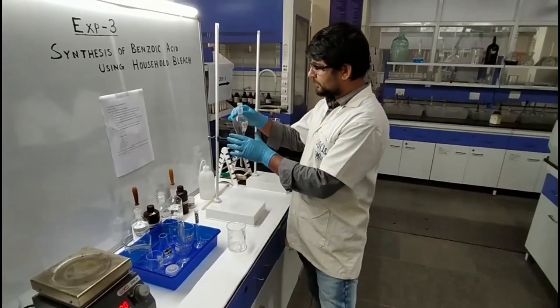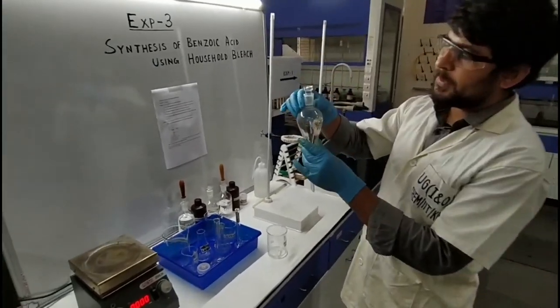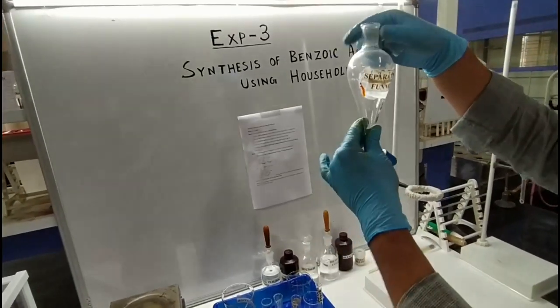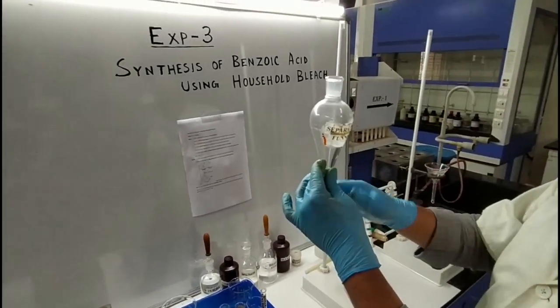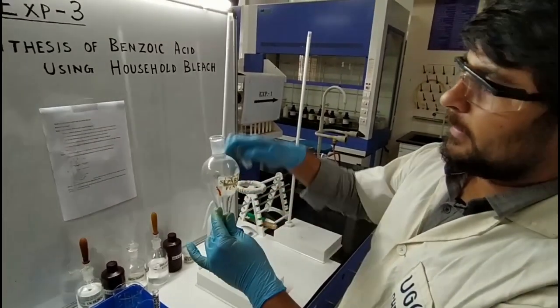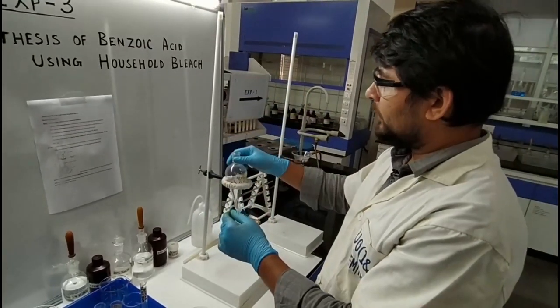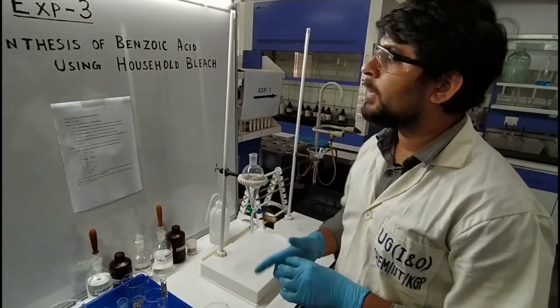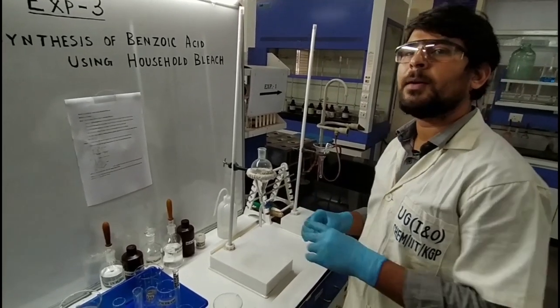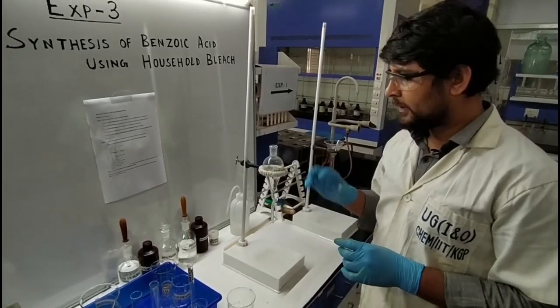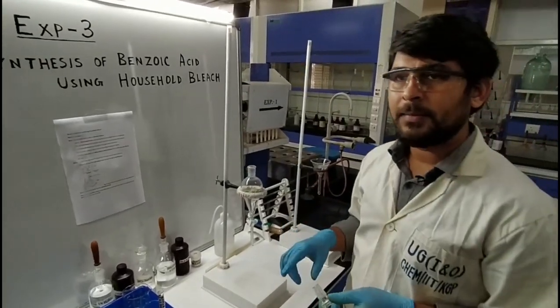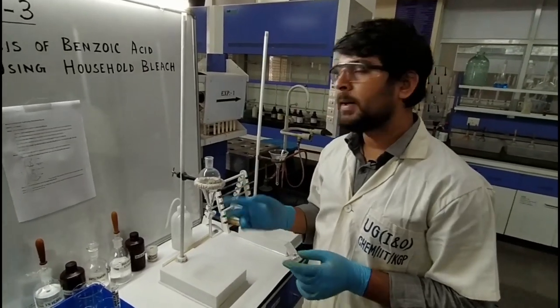After 10 minutes, we have to take a separating funnel like this. We have to transfer the reaction mixture into the separating funnel after 10 minutes, and then we also have to add 10 ml of diethyl ether into it. So two things we have to transfer into the separating funnel: one is the reaction mixture and the other is 10 ml of diethyl ether.